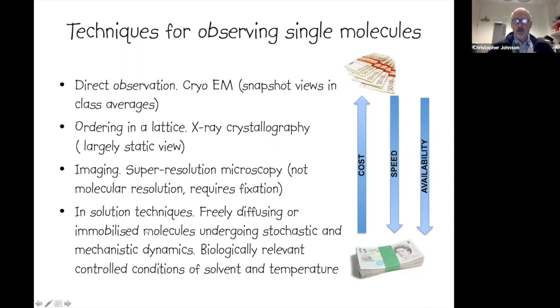Then we have a group of techniques, single molecule techniques, which are in solution techniques. These are the techniques I'm going to talk about today. And in these methods, we have freely diffusing molecules. Sometimes we also have immobilized molecules, but generally they're all undergoing stochastic and mechanistic dynamics during our measurement. And we can also, in addition to observing these dynamics, make the measurements under very biologically relevant and controlled conditions of solvent and temperature.